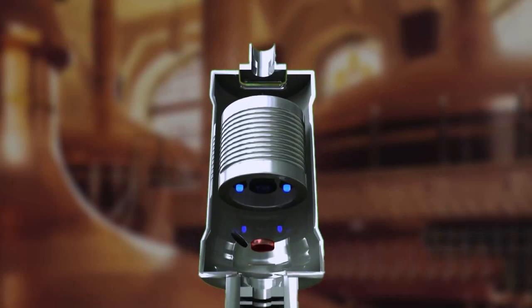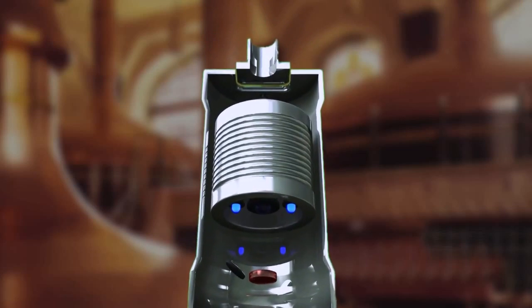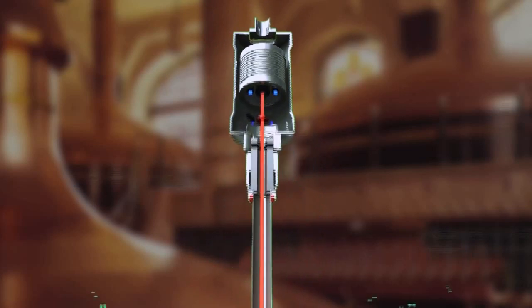But it is not the only requirement the breweries demand. Sensors must be rugged, easy to use and simple to maintain.